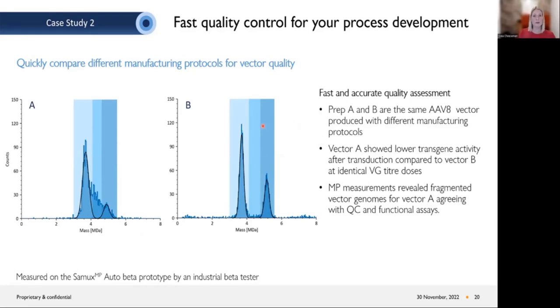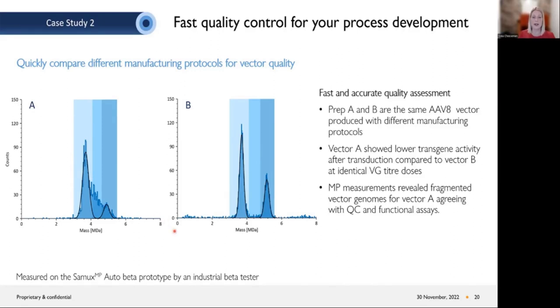A second case study from the same collaborator involves the same vector produced by two different manufacturing protocols. Vector A showed lower transgene activity after transduction compared to vector B at identical vector genome titers. When both samples were measured on the mass photometer, the reason became clear: production A showed a large amount of partials, whereas vector B was very clean. These mass photometry measurements are in line with the QC and functional assays they performed, but you can access this information very quickly — literally in minutes — during process development, allowing rapid comparison of two different approaches.